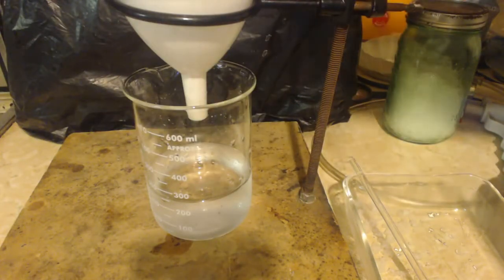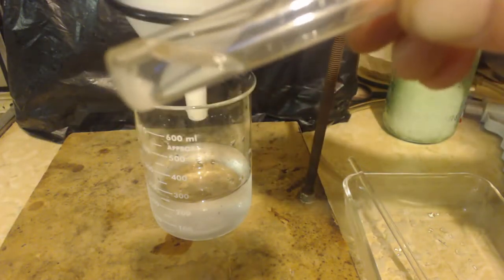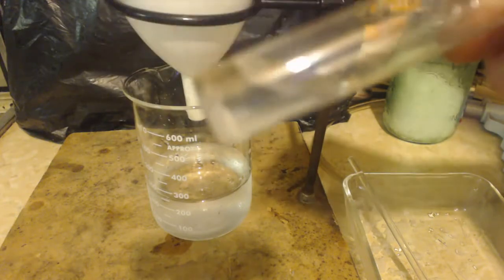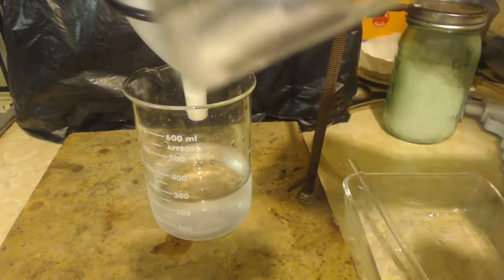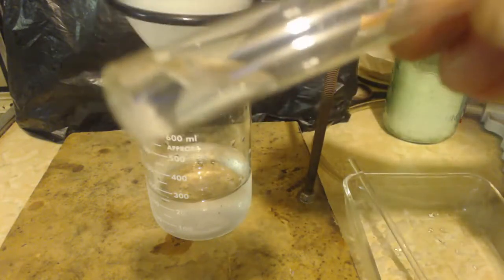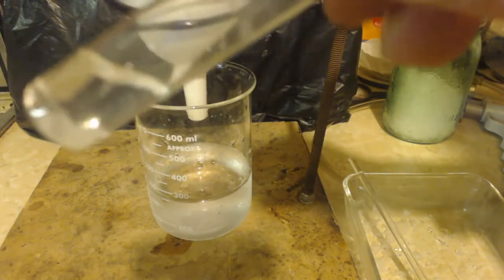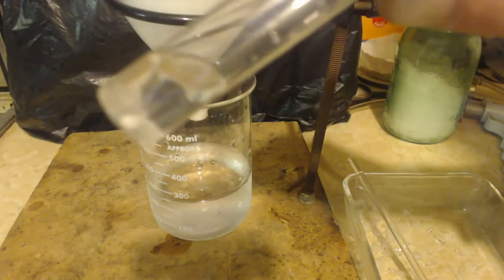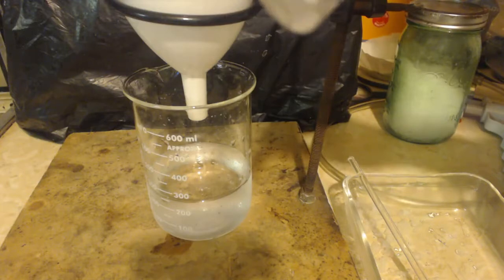Now, if this was ammonium chloride, it would be dissolved. You know what I mean? You can see it now, I think. But anyways, it's still in there, so there you go. You can see when I turn the thing. So it has to be calcium sulfate.